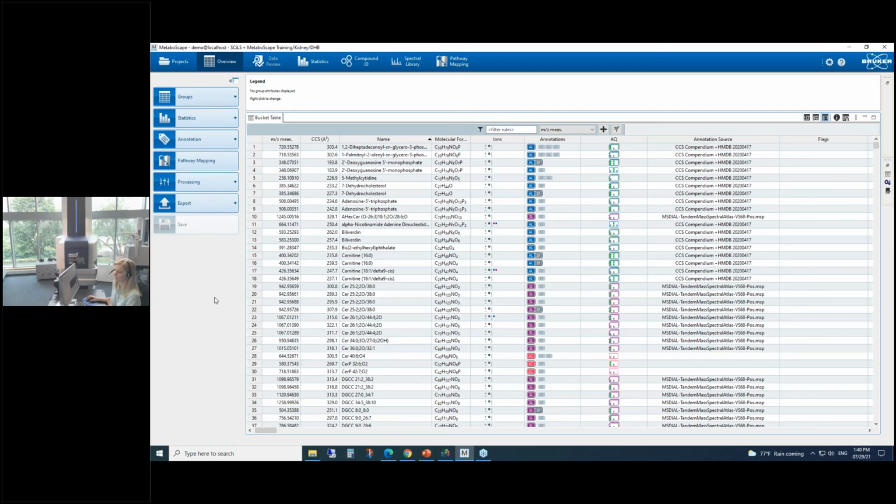Whether you use Metaboscape for analyzing and integrating MALDI-guided metabolomics data, which would be a future webinar topic, or if you do direct image annotation, which is what I'm going to show you what all of this information on the screen is pertaining to, it really is the ideal software tool for our dual-source timsTOF fleX. Okay, so let's see how we can use this to gain another layer of information in our data.